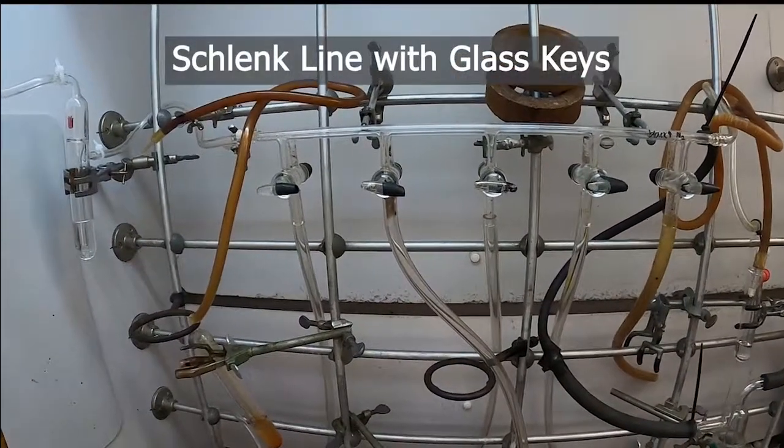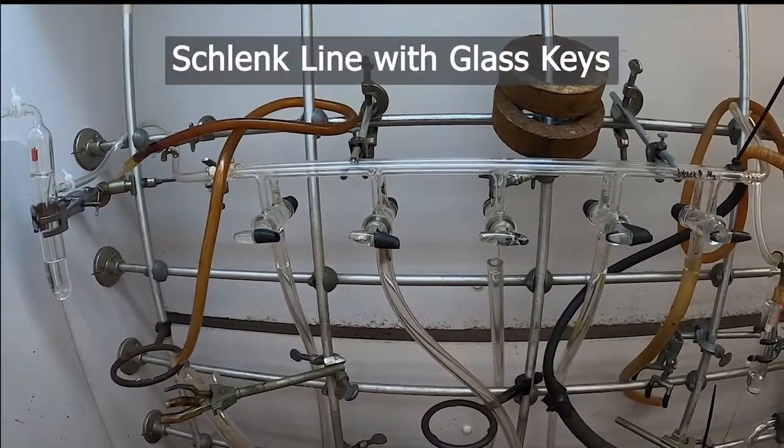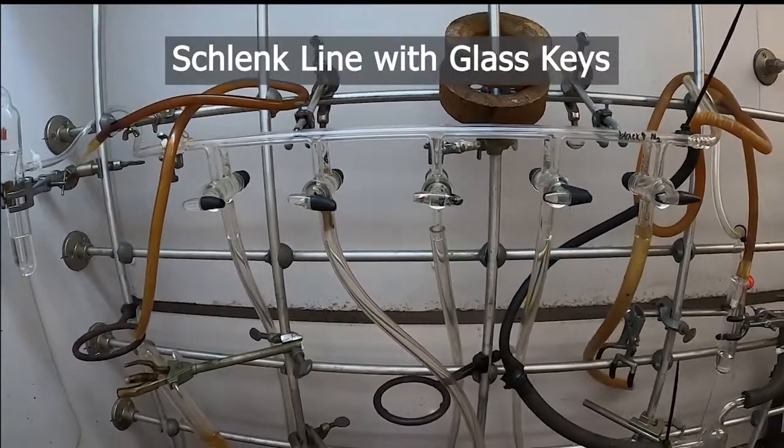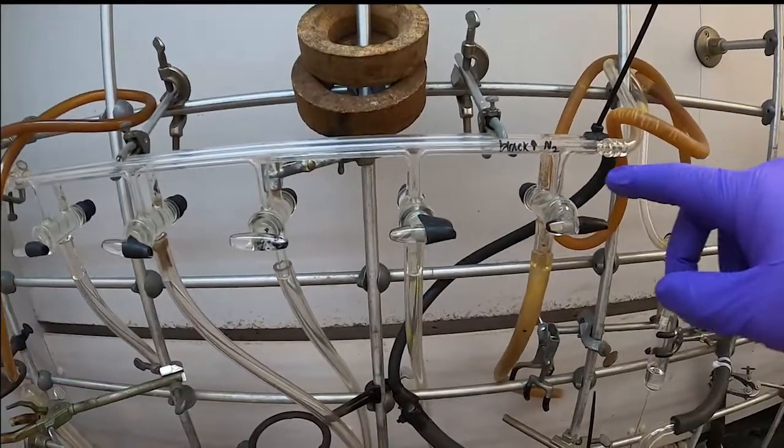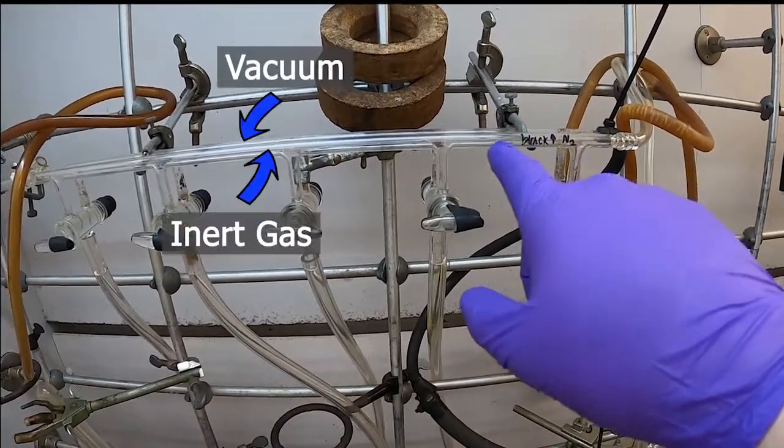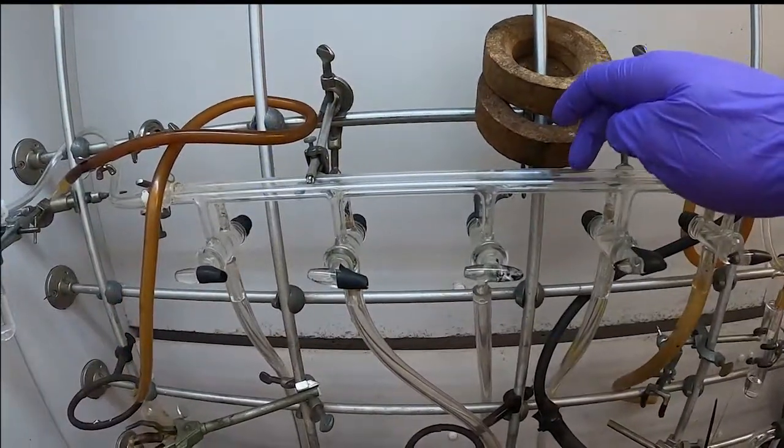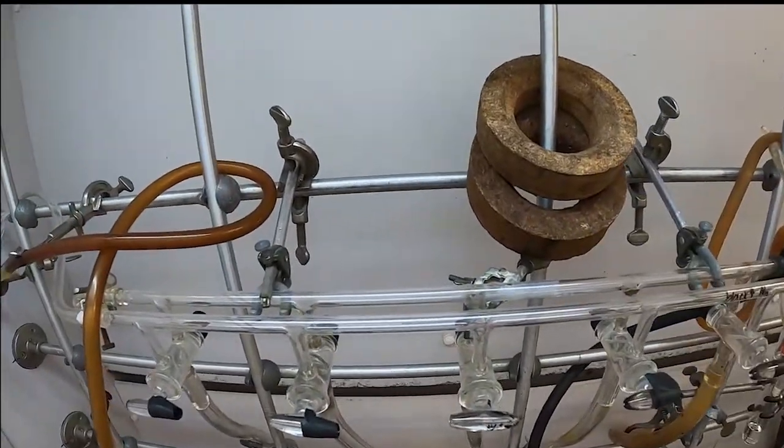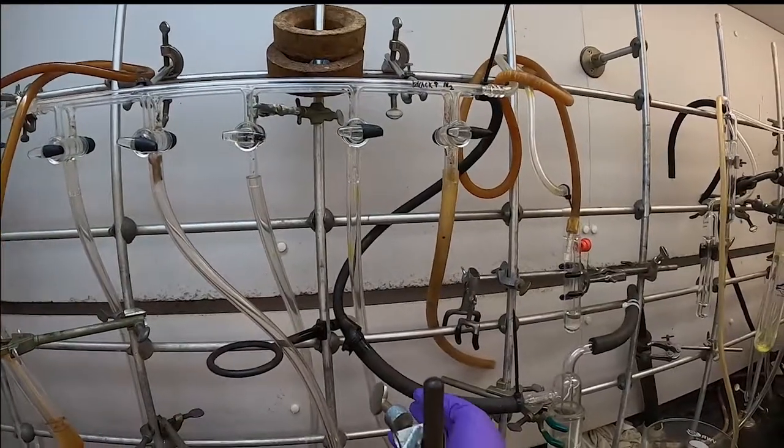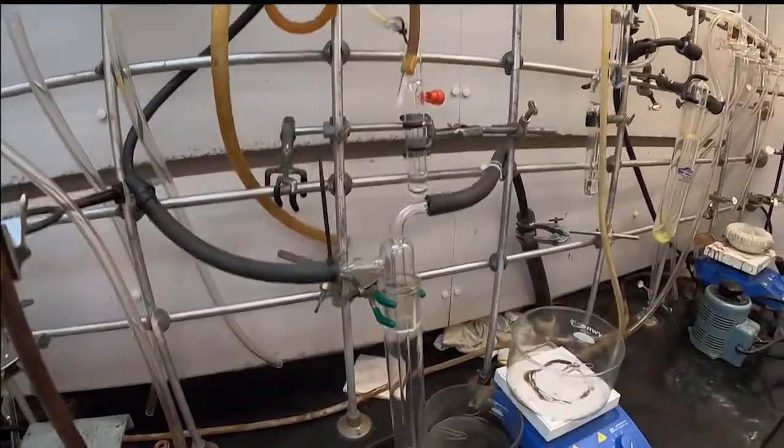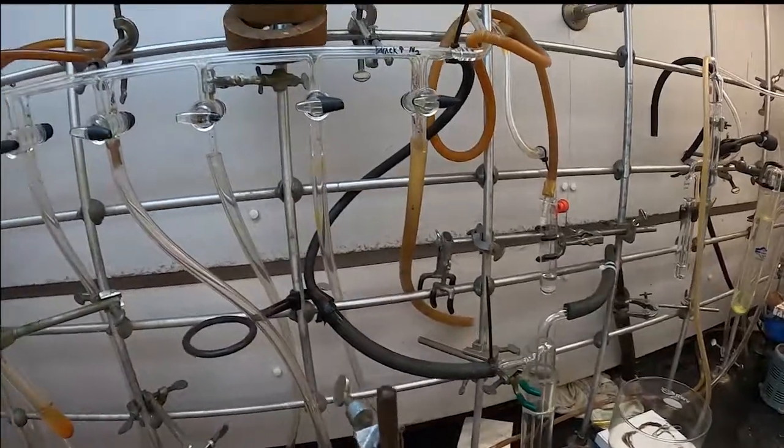So the other common style of Schlenk apparatus is this kind with the glass stopcocks. So you can see here, this front line, it's been conveniently labeled as the nitrogen, and the one behind is for vacuum. You can see it connected here to the trap and the vacuum connection over there.